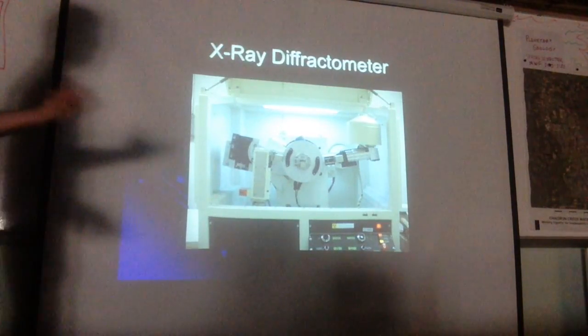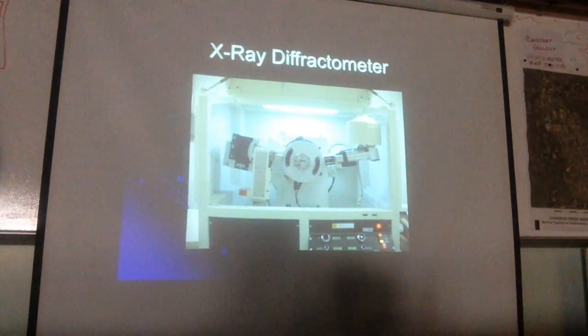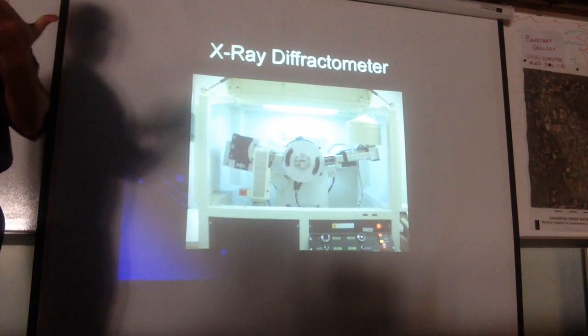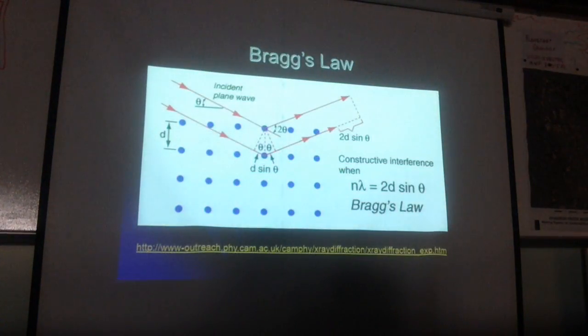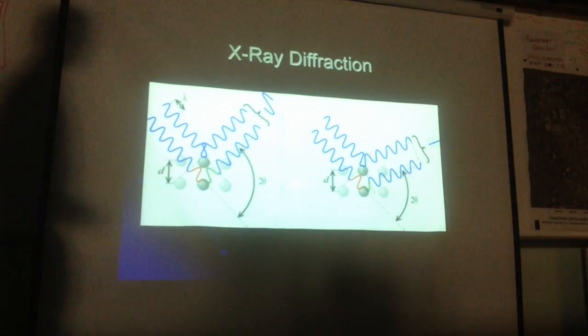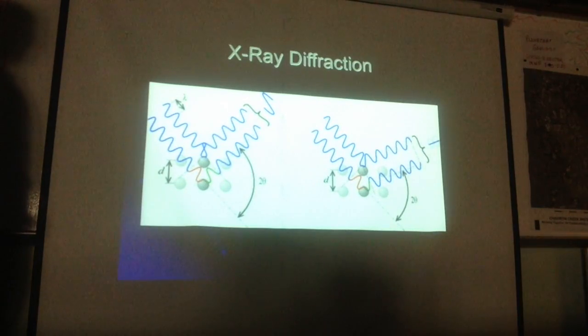Because usually your typical scan depends upon the scan speed, which you can also input, so how many degrees the machine scans per minute. Going back for a second, when we talk about this 2 theta angle, you typically adjust it between 0 and 90 degrees.